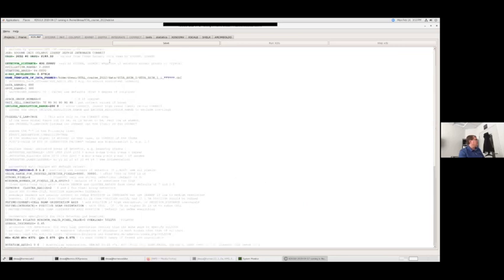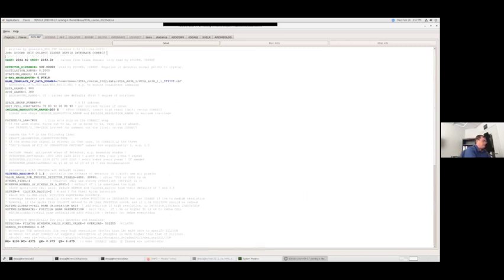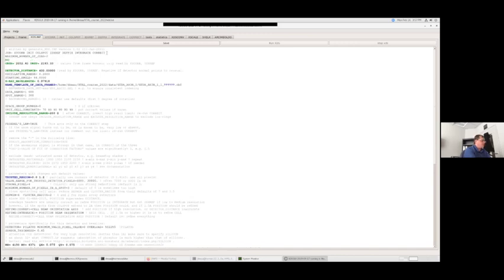Okay. So the only other thing you would want to add in here is maximum number of jobs equals, I use 2, and maximum number of processors. We're going to set that to 6. Okay. How do you decide on this?